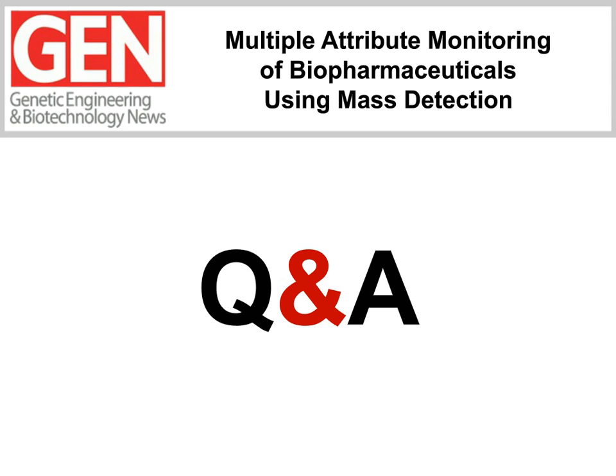Okay. The next question asks, does N-glycan deglycosylation go to completion? So again, another very good question. The answer to that question is yes. We've done a variety of different assays, gel shift assays, as well as other approaches, including MS, to look at the molecule after deglycosylation. And in each of those studies, what we found is that the deglycosylation goes to completion.